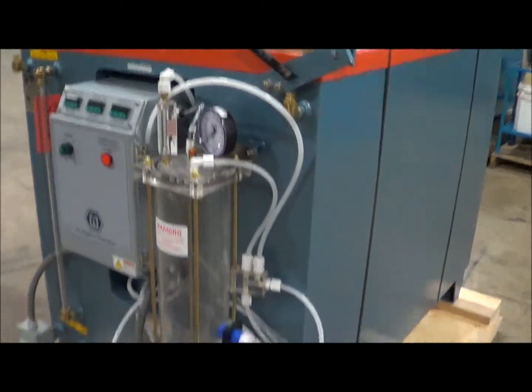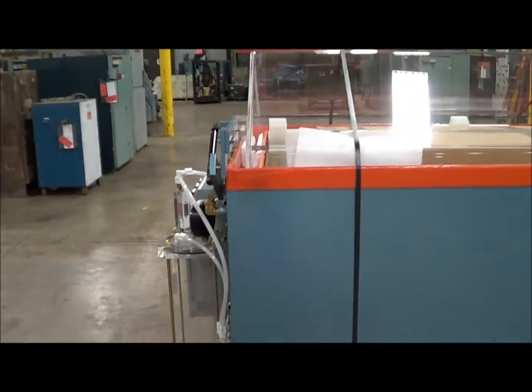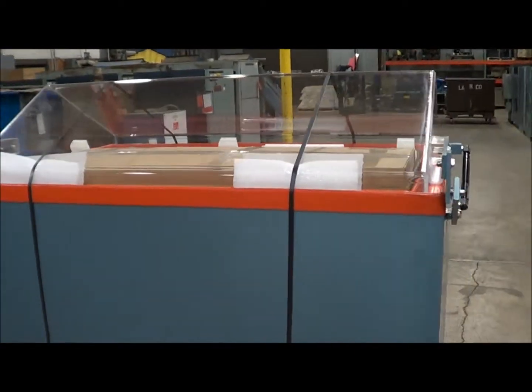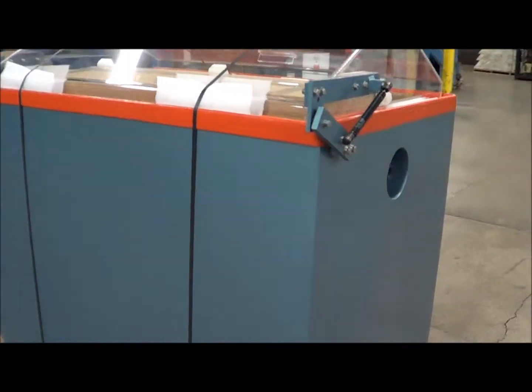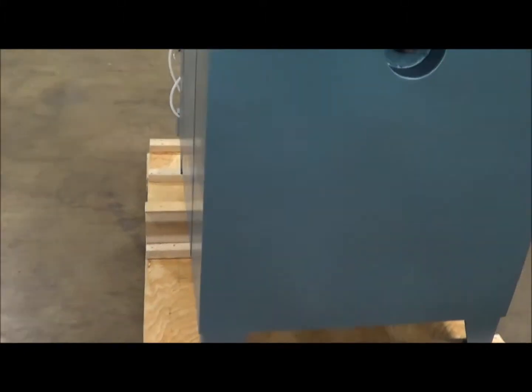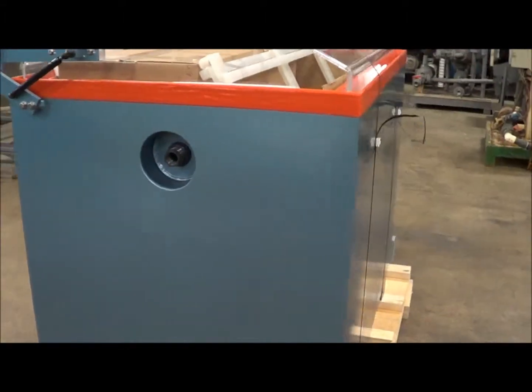Very nice unit from Singleton. Inside dimensions: 48 inches long, 30 inches wide, 36 inches deep. Outer dimensions: 65 inches long, 41 inches wide, and 57 inches high.